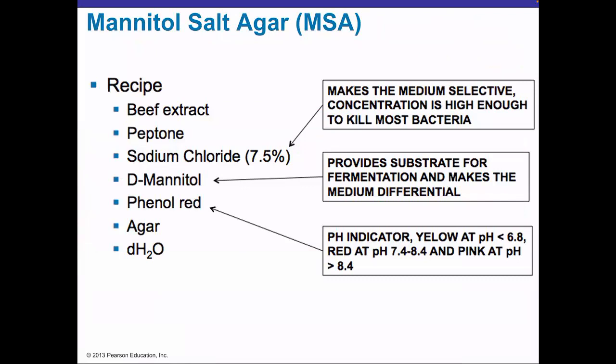Let's now look at the next medium that we are discussing today. It's called mannitol salt agar, or MSA.